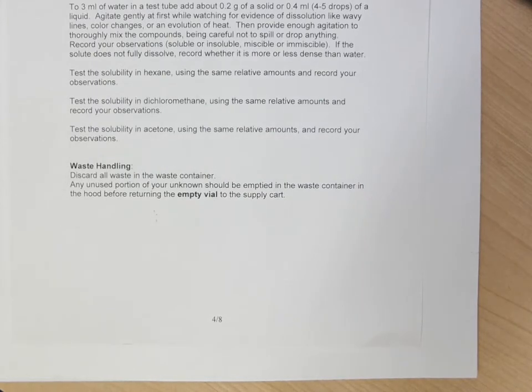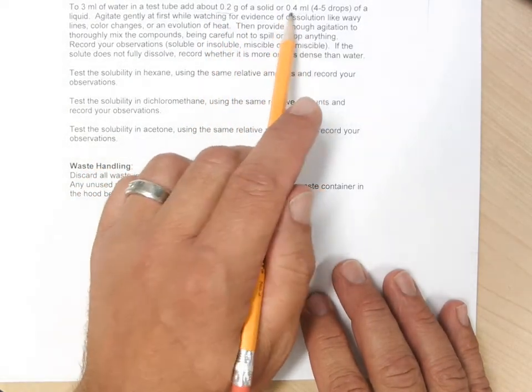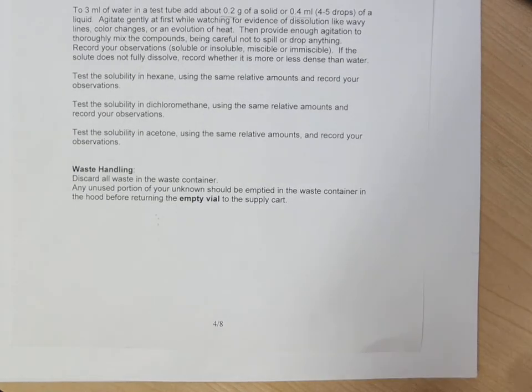Again, we have a more detailed procedure here for how much solid you would put in with how much liquid, and agitate it first and look for any evidence that it's dissolving, and then whether it dissolves or not is very important.